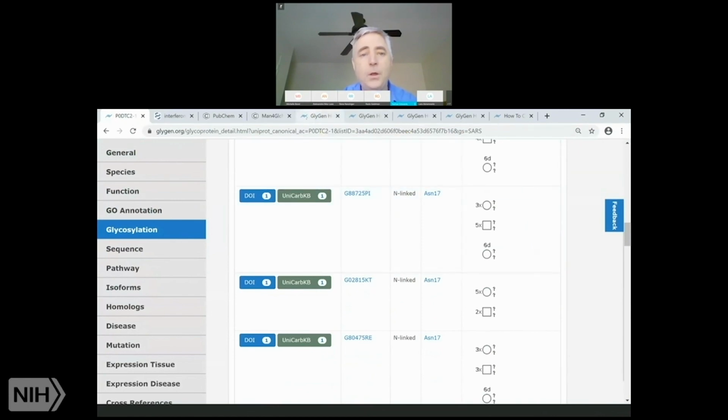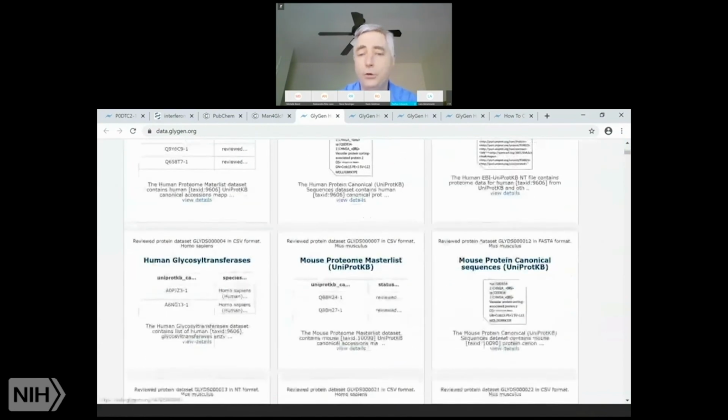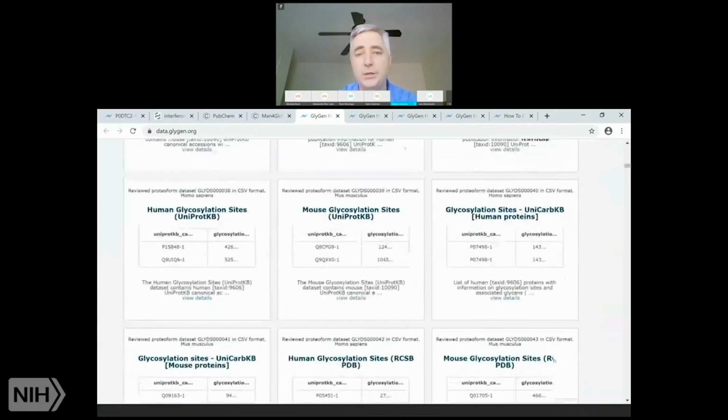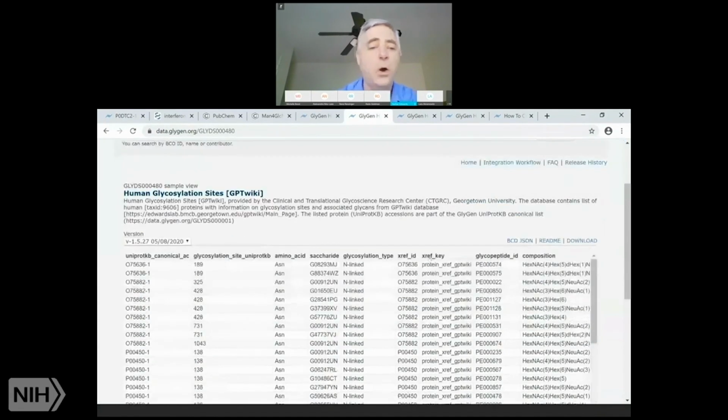All right. I'm quickly going to show you a little of the information in the data section. This is information that you can use as an informatician. All of the information that GlyGen consumes to construct the site is listed here. In particular, I'd like to show you the data that's been acquired as part of the GlyGen project that Dr. Goldman talked about earlier today.